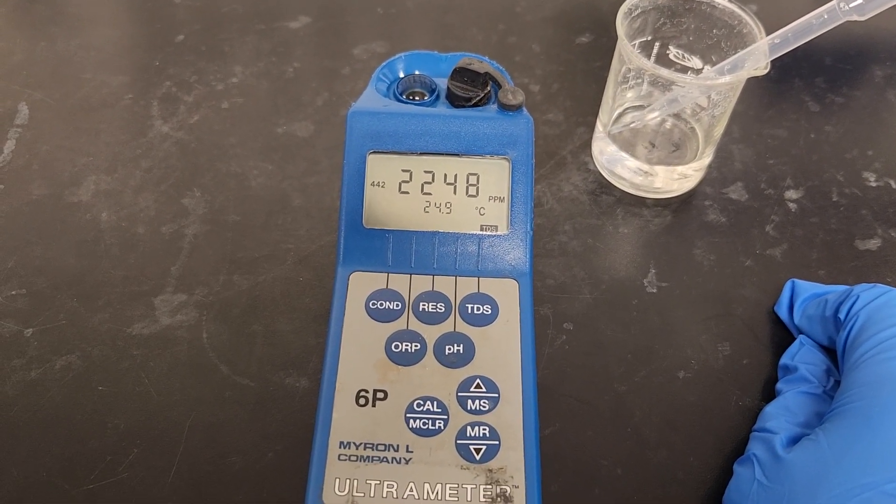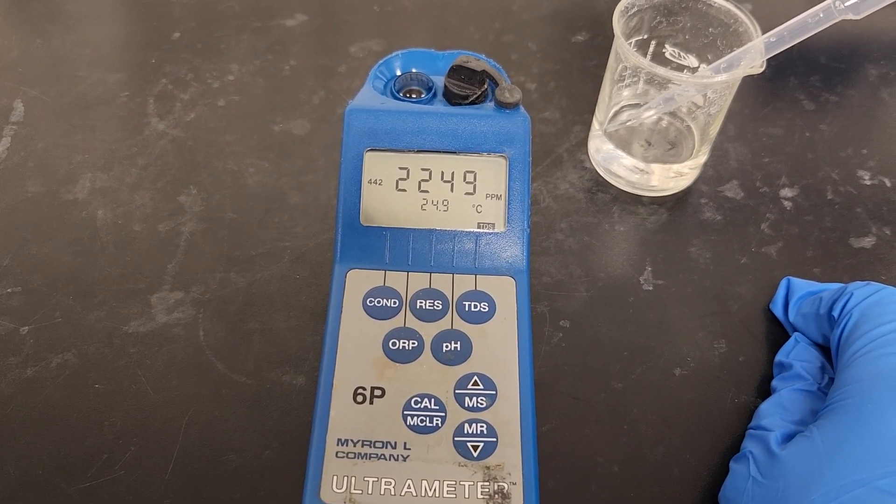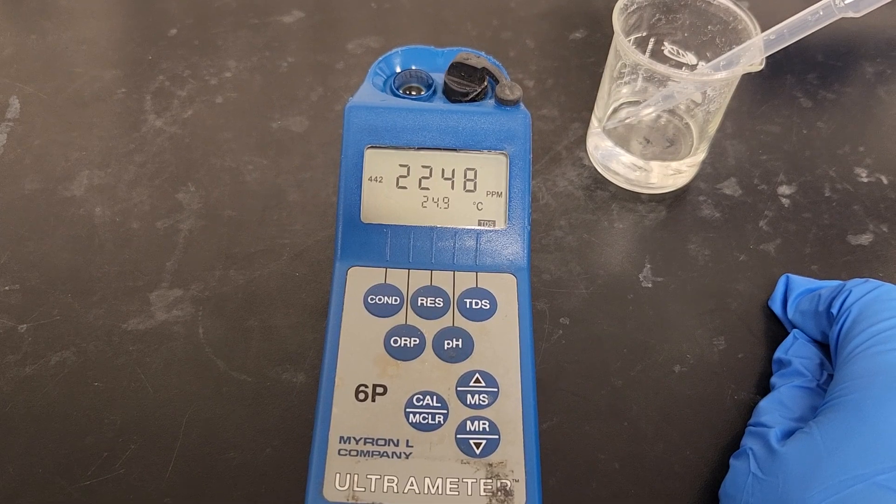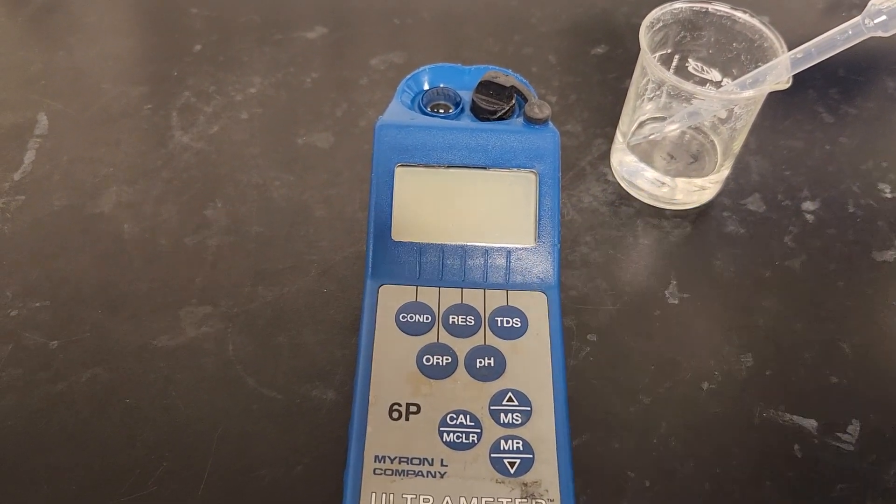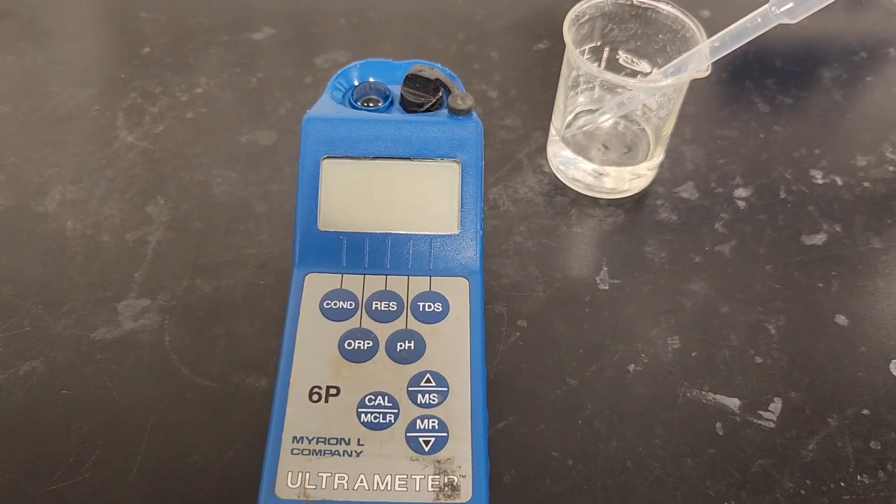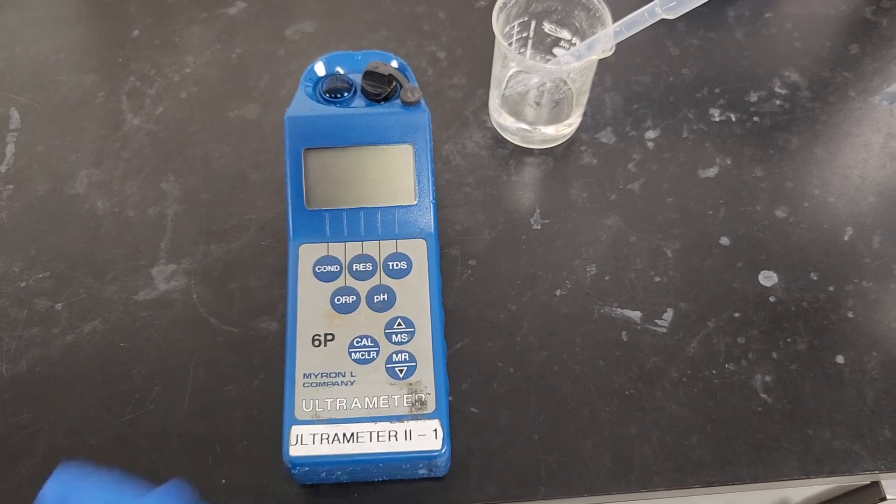So right now it's giving us 2249, 2249, 2248, which is in that range. So I like to lock it, so what we'll have is 2248. I will record that value down and still with the same sample I now want to measure the conductivity of that sample.